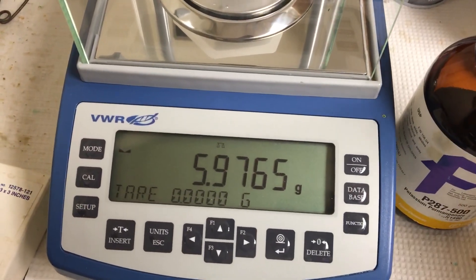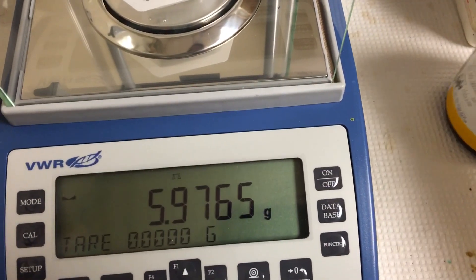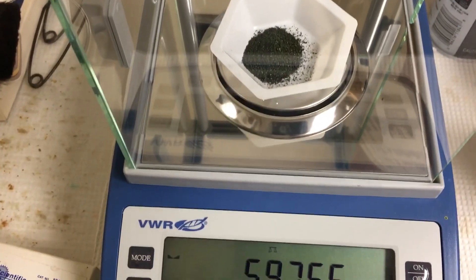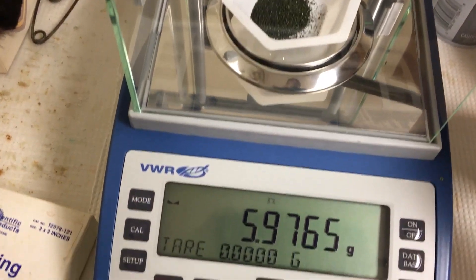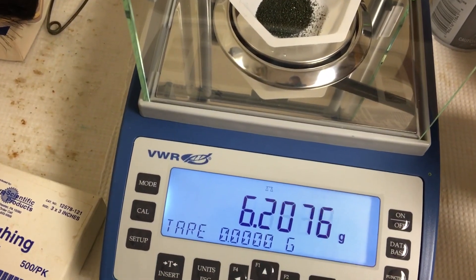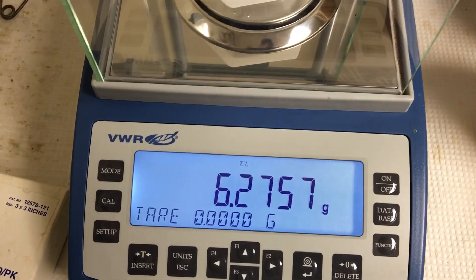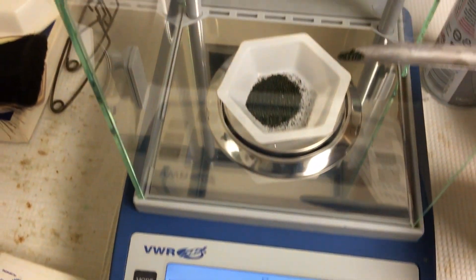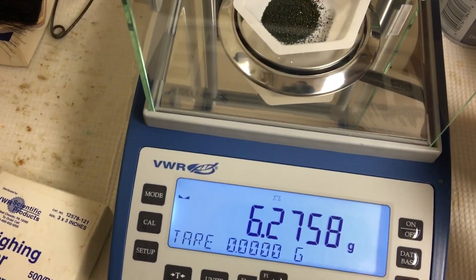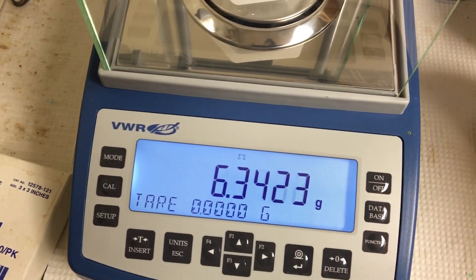I already pre-weighed this one — it's almost there. We're going to add a little bit more. Target is 6.322. You need to be very careful. I added a little bit more — you see it? Now it reads 6.3, just about good.